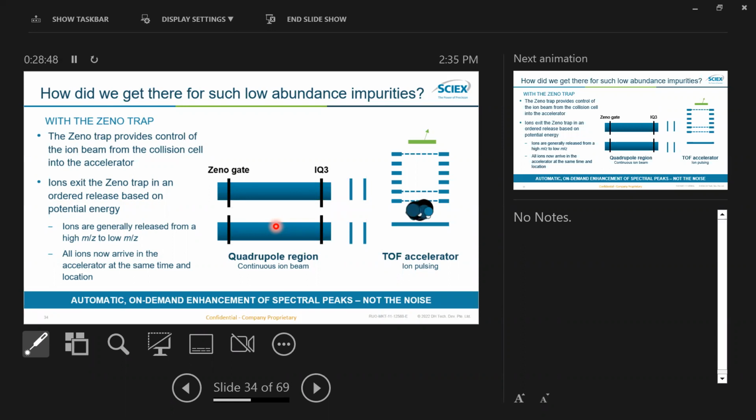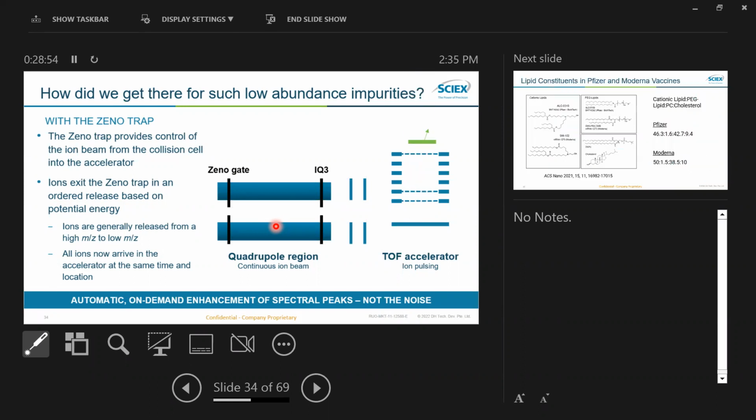With electron fragmentation we're generating hundreds of peaks, but we're really diluting the ion current down after fragmentation, so to take advantage of the peaks generated by this type of fragmentation mechanism, it is important to maximize MS sensitivity.